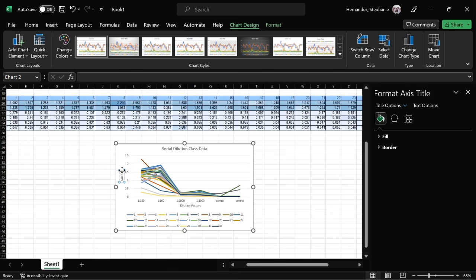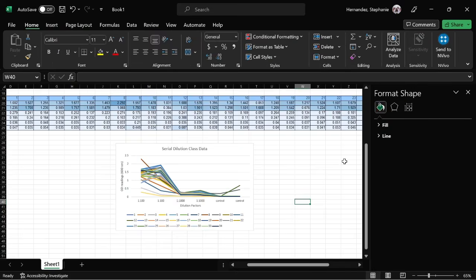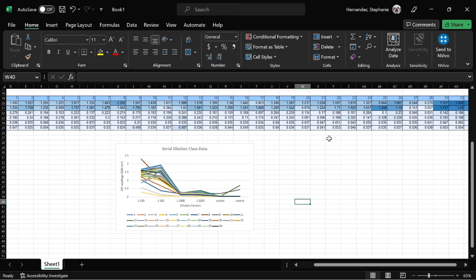And then this here, what it's measuring is the OD readings, the optical density. And I want to specify that that is at 600 nanometers. Because, for example, if we weren't using crystal violet, we wouldn't be using it at 600 nanometers. It would be depending on what we're using. So it's important to specify. Okay, awesome. So here is our finished first graph.